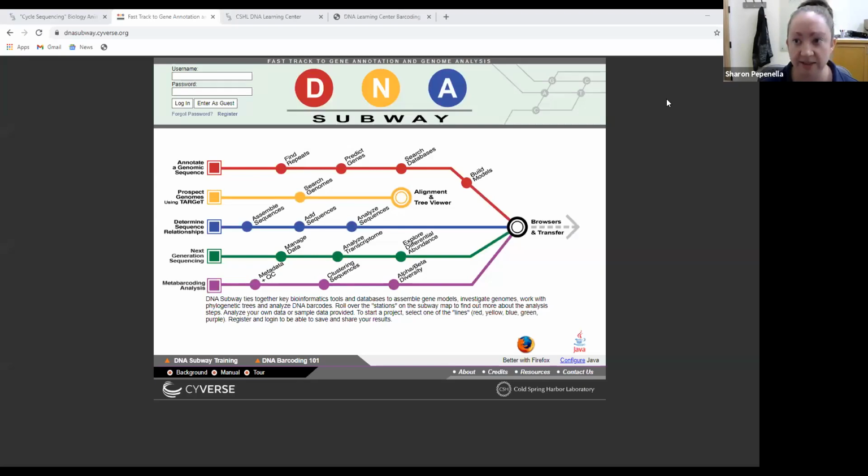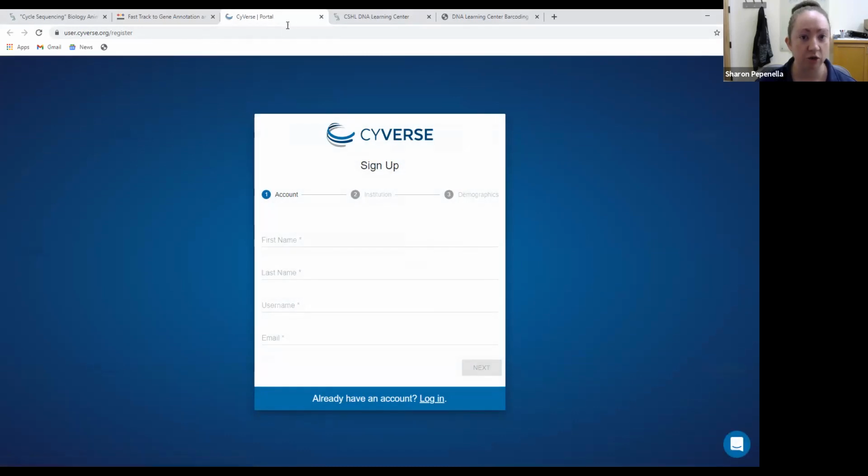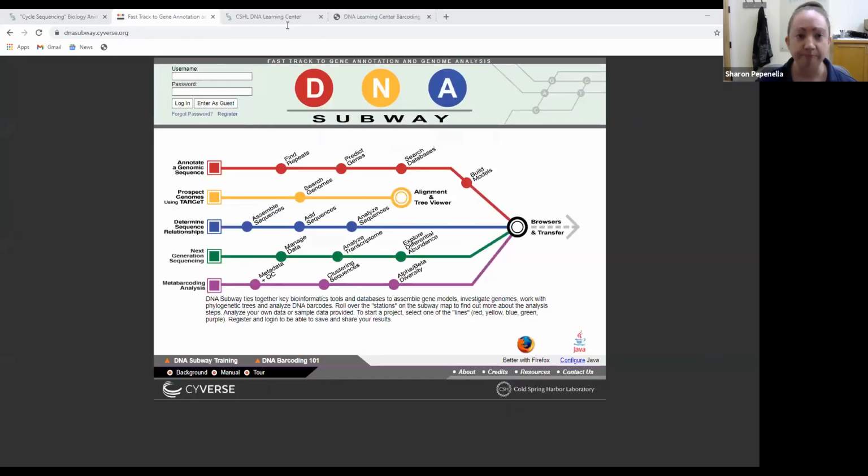Okay, can everyone see that here? Yes, okay. All right, so this is the home page of DNA Subway. You'll notice in the upper left-hand side here, you have the option to log in or to enter as a guest. For today, you're welcome to follow along by just entering as a guest, but for your US Ants project, please, please, please do register. You'll just click on the register button here. This will take you to the Cyverse portal, which will allow you to create an account and register with DNA Subway.